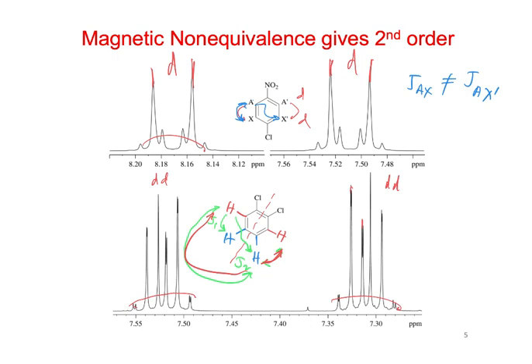I don't know why they're necessarily all sloped to the one side, though. You know, sometimes you get this experimentally just because of how the peak is sampled, like the number of points, because these lines are usually drawn from points, and if you don't have enough points to draw the top of the peak up like this, it can go from one point to the next. But I don't know why it would be doing it here. Oh well, okay.